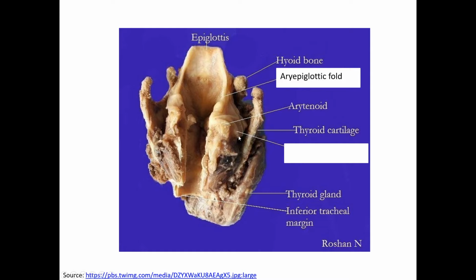And just down here, between the thyroid cartilage and the cricoid cartilage, as an extension of the hypopharyngeal mucosa, is this structure down here. This is also going to be one of our margins. Any answers for this structure here? Yep. So Prashant said piriform fossa, and piriform sinus is our answer, so that's correct.